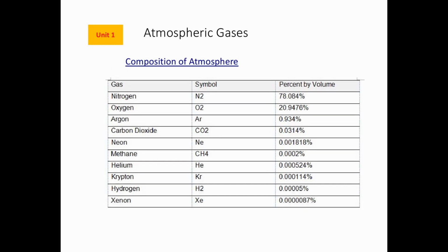This table is from literature listed in the 1990s. Nitrogen is 78%, oxygen about 20.9%, and argon 0.9%. You see the CO2 at that time was roughly 300 ppm. And it contains other trace components: neon, methane, helium, hydrogen, etc.